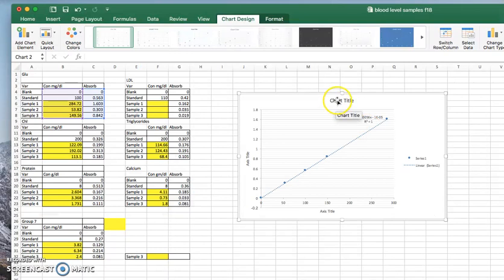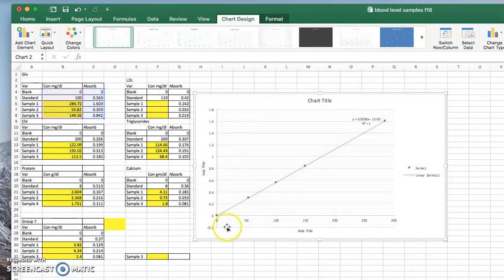So it gives us a nice perfect line of best fit, and this lab always gives us a nice perfect line of best fit. Now if I wanted to, I can take any absorbance. Let's say the absorbance is 1.2, come over, come down, and if I actually had hash marks, I could figure out what that is. So the chart needs a title.